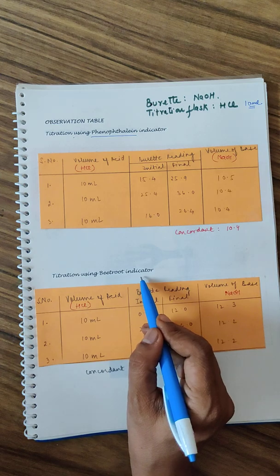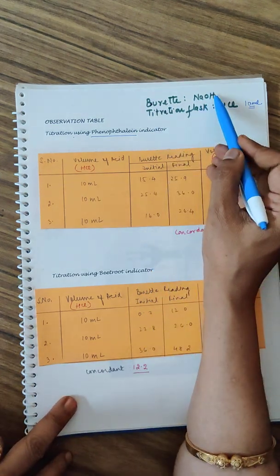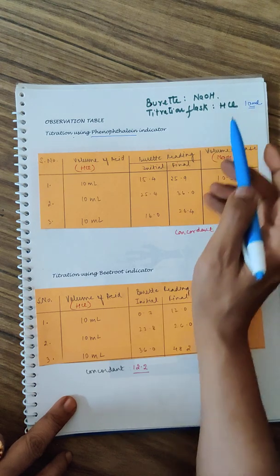When 10.4 ml of NaOH is added, the solution changes color. At the end point, pH is on the basic side. When you see the change in color of phenolphthalein, it changes to lightest possible pink from colorless. The same titration is to be done using beetroot indicator.